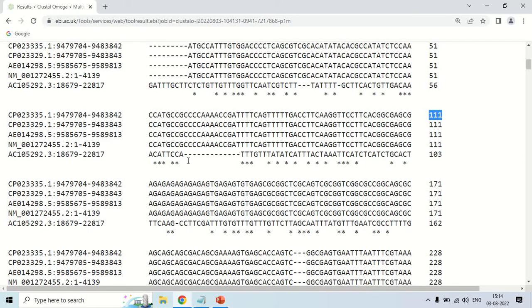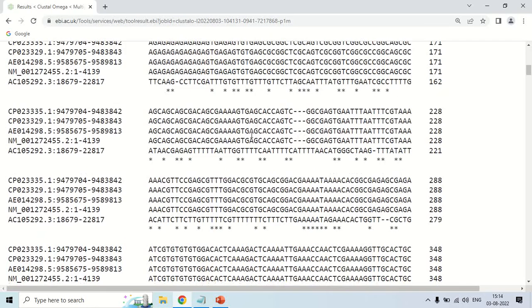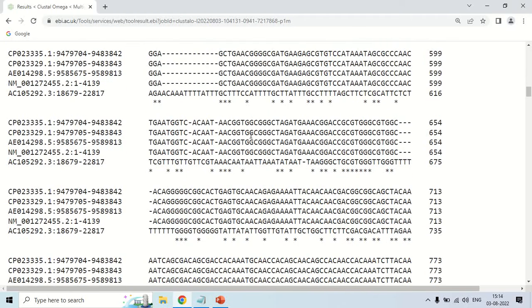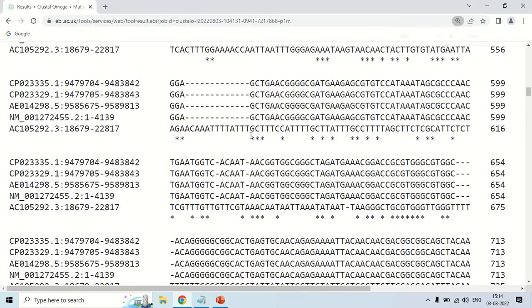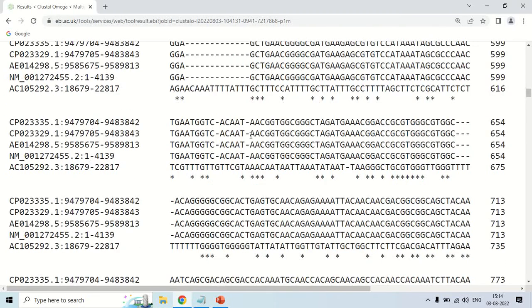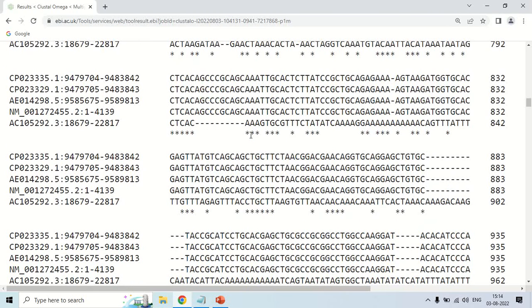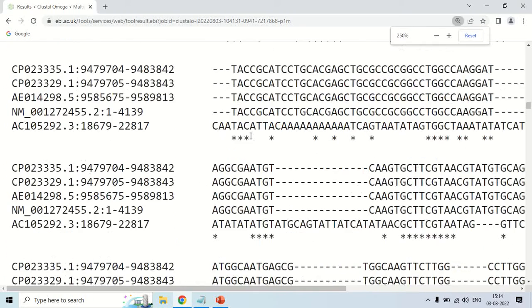Again, these dashes represent that there is no base in the fifth sequence corresponding to those bases. You can scroll down and there is a lot of data because you have taken five sequences, so it gives all possible combination alignments between them — first aligning the first with second, then first with third, then first with fourth, and so on, which is why there is so much data.